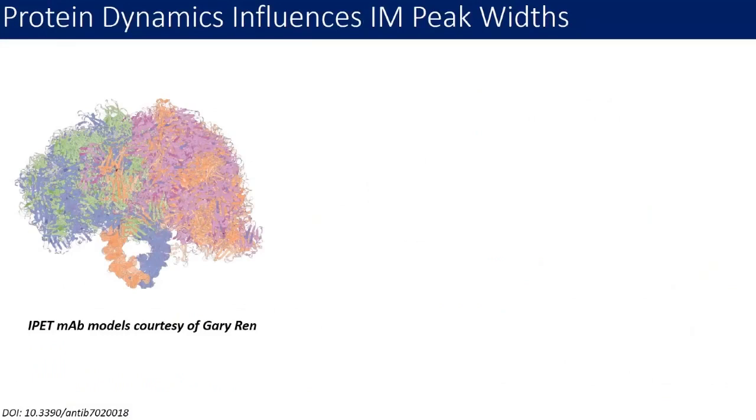Another potential challenge here is that, again, proteins are very dynamic entities, and they occupy a range of structural forms in solution prior to our analyses. And just to make this particularly relevant for our conversations about biotherapeutics, here's an overlay of about 360 individual model structures for antibodies derived from IPET-type measurements.